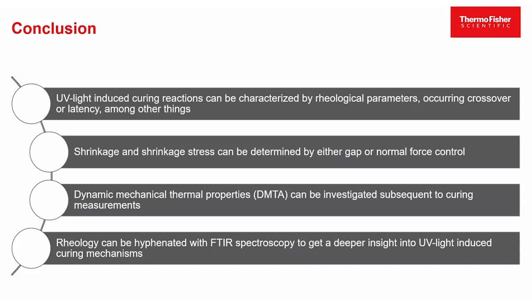When adding subsequent measuring techniques like the DMA or the DMTA, also the thermomechanical properties can be investigated quite nicely.